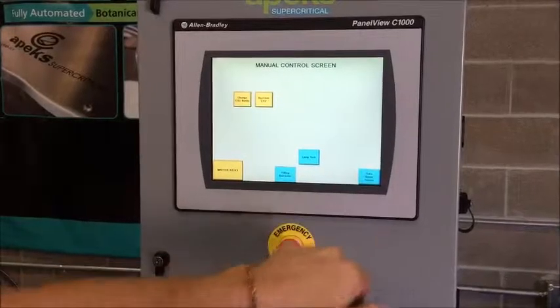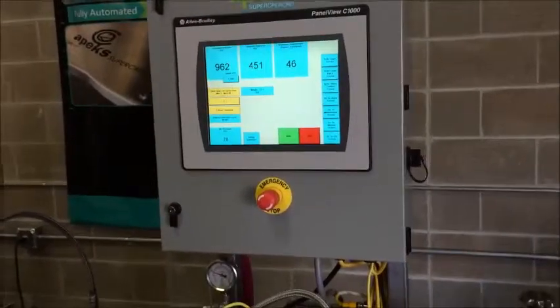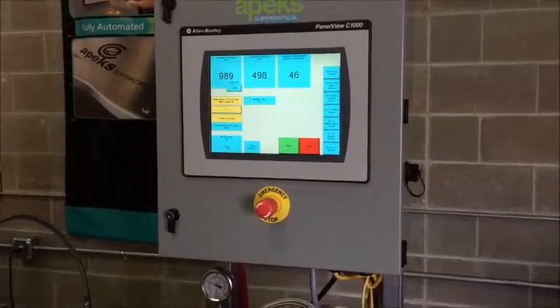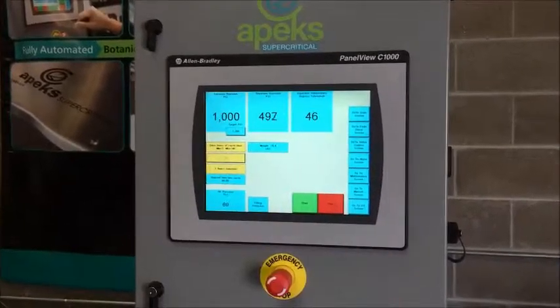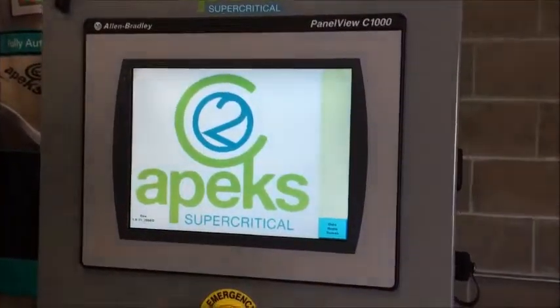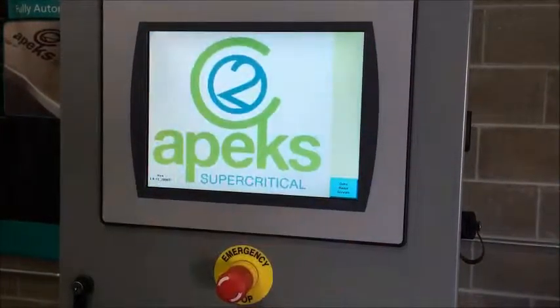If you find that top-to-bottom or bottom-to-top flow works better for you, over here on our main loop screen we have the option of reversing. There will be an option for reversing the direction of flow, so you can control whether you're flowing top-to-bottom or bottom-to-top. It's still filling, so we'll let it keep filling.